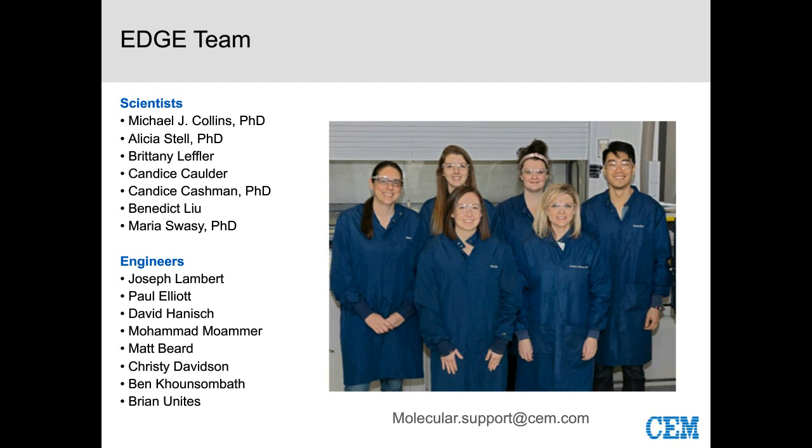Is the whole open area in the Edge covered with nitrogen? No. With the nitrogen option, on the Edge we have an internal pump. Any time the pump is used, when it pressurizes the initial cell and when we use it for purging, it is pulling air. The way the nitrogen works is that you plumb nitrogen to the bottom of that pump, so instead of pulling air, it pulls nitrogen.